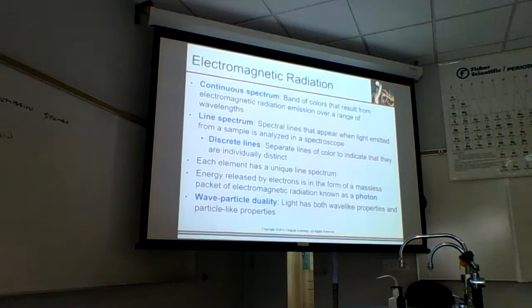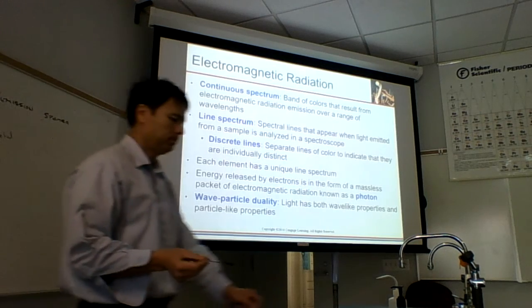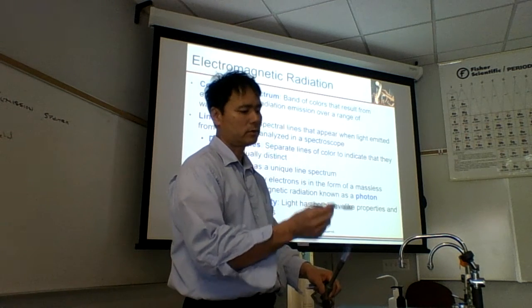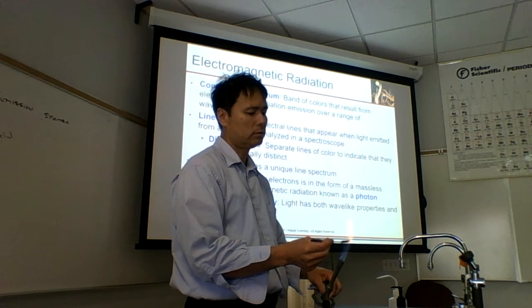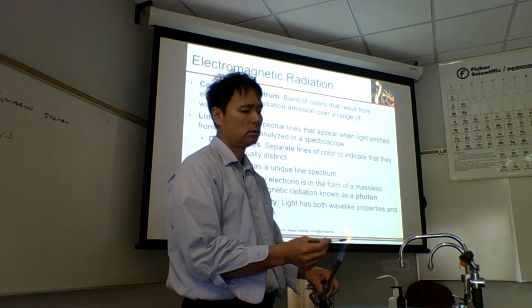This is stainless steel. Stainless steel is a little bit harder to oxidize. But most metals, you heat them up and they'll start to become oxidized. This one's already been oxidized a little bit. But what's going to happen as I heat up the metal? It starts to glow. Do you see that? It starts to glow red, and then it starts to glow orange.